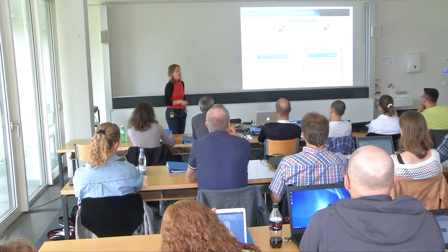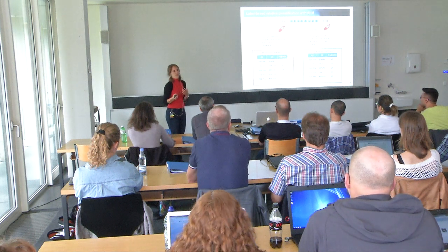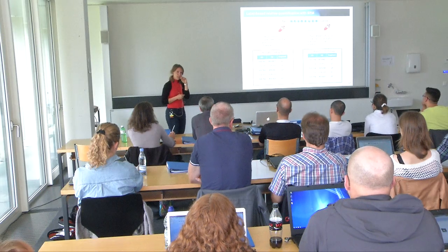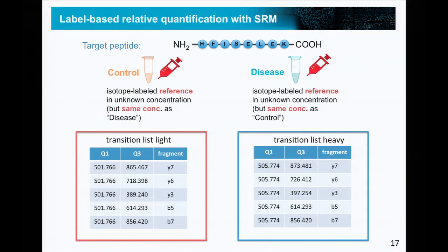Okay, but isn't that a big problem now for my measurement? I mean, now I will measure the exact same masses here. Now my one peptide will pollute the other. I will get wrong intensity for these B ions, no? Exactly. Because we have this different Q1 and we have this around 1 Dalton resolution precursor isolation window that we can achieve in the quadrupole, we are far beyond this 1 Dalton, so the instrument should have no problem to differentiate these two because of the different Q1 mass.